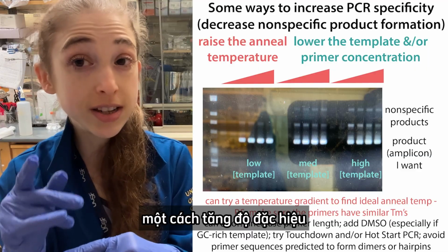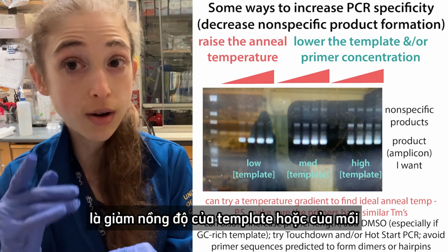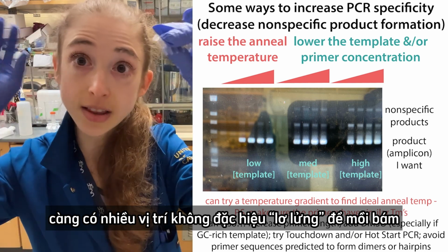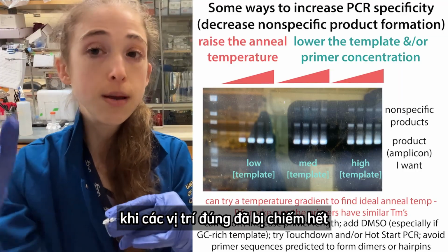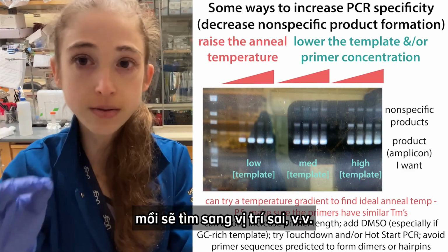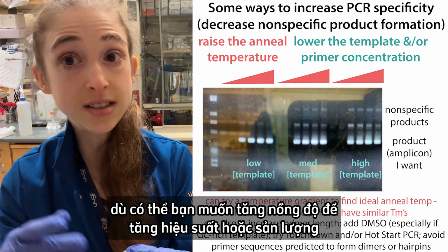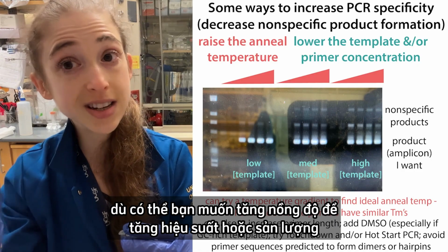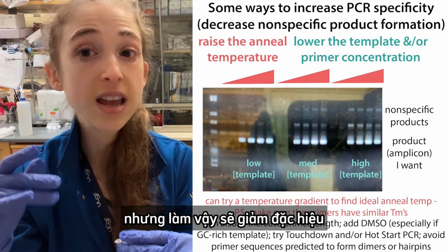One thing that you can do to increase your specificity is to decrease the concentration of either your template or your primers. The more template there is, the more of those non-specific sites there are hanging around for the primer to find. The more primer copies there are, if all the right sites get used up, then the primer can find the wrong sites. So if you have too high concentrations, you can get a decrease in your specificity. Although it might be tempting to increase those concentrations to increase your yield, you're going to decrease the specificity if you do so.